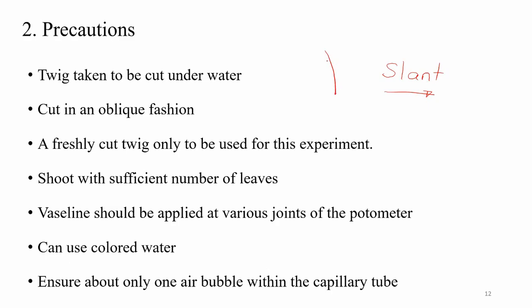The slant position. Assume my drawing is also slanted. Assume this is the shoot, so you can cut in this direction, or you can cut with a slant movement. This is the slant.